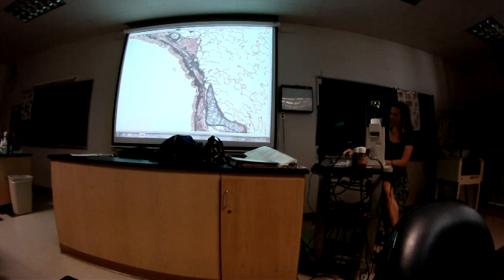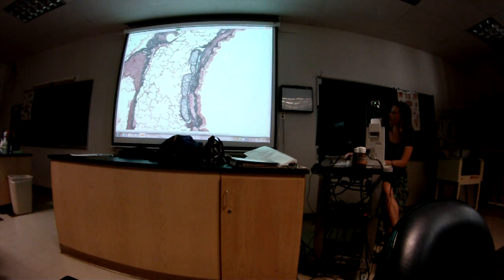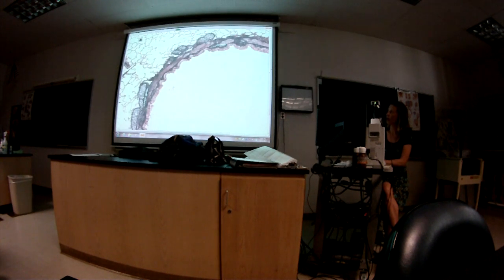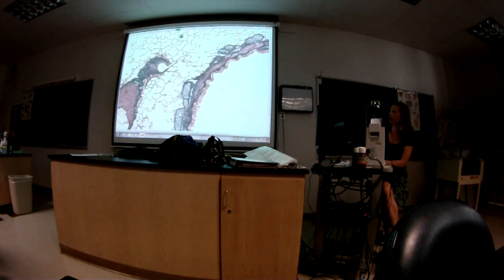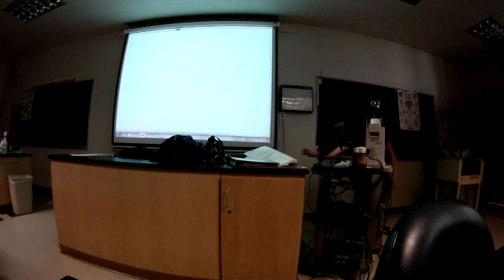And then you see, yeah, hyaline cartilage there. And over here, there's some smooth muscle. Lots of smooth muscle. There's the epithelial lining. So what is this organ? Bronchus. This is a bronchus. Yes. So number 10 is a bronchus. Bronchi, plural. Okay, let's look at the other one on the other side.